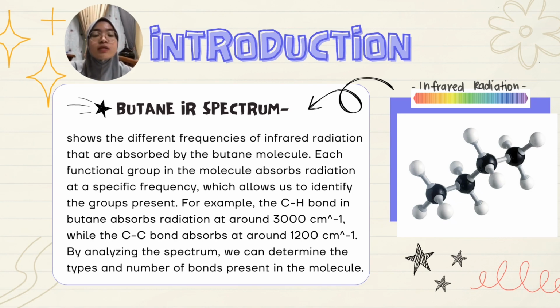For example, since butane has a linear hydrocarbon chain, you would observe a strong absorption band due to the CH stretching, normally in the 2850 cm-1 to 3000 cm-1 region, and appears as sharp peaks. Based on the peaks of the butane infrared spectrum, you would observe peaks for the CC bond, symmetric and asymmetric stretching vibration of the methyl group that is present in butane, and more.